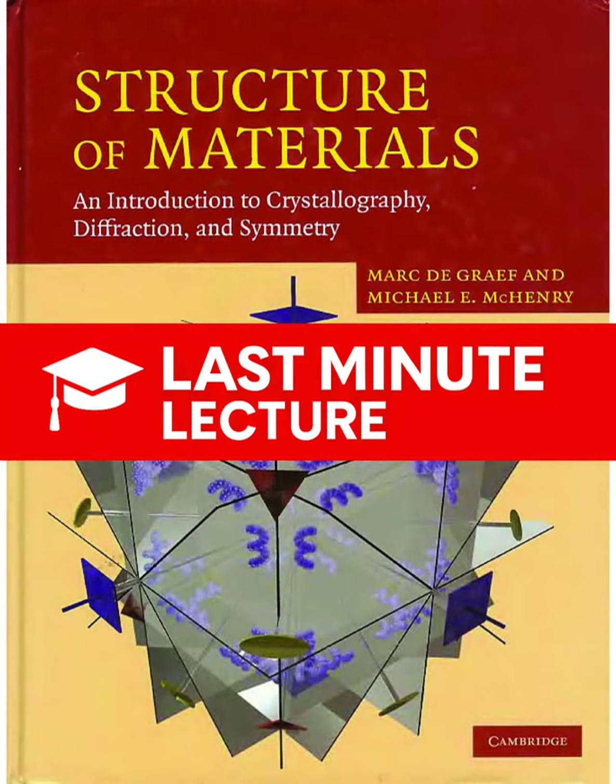Second, its magnitude, its length, is defined as the inverse of the wavelength. So |k| equals 1/lambda. So a shorter wavelength means a longer wave vector. That seems simple, but I have a feeling this vector relationship is going to be incredibly important later on. It's the foundation of the Ewald sphere. That vector k is always oriented perpendicularly to the planes of constant phase, pointed right along the X-ray's direction. It basically packages all the input information about the radiation into one manageable reciprocal space vector.